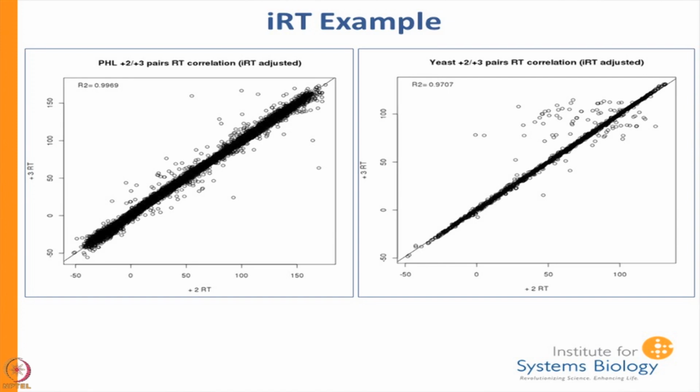You'd expect in a perfect world they just lie along this axis. But you see that there are some outliers, and the width of this is kind of big. You could look at this and say, well, that's actually ±5 minutes or ±3 minutes, something like that. That can help you to decide how wide a window to look at when you're trying to look for these things.